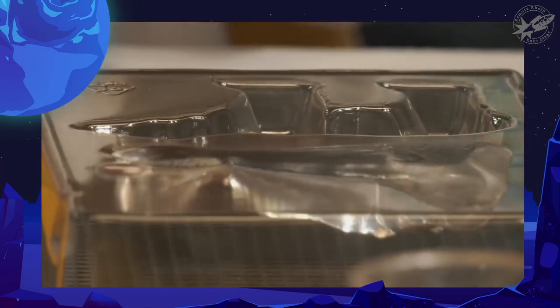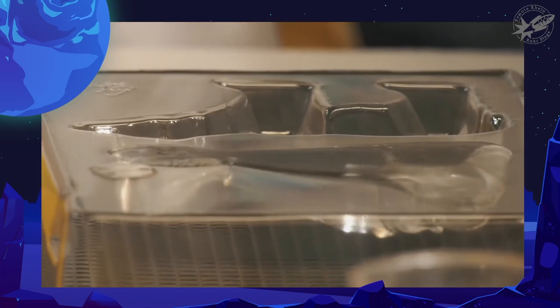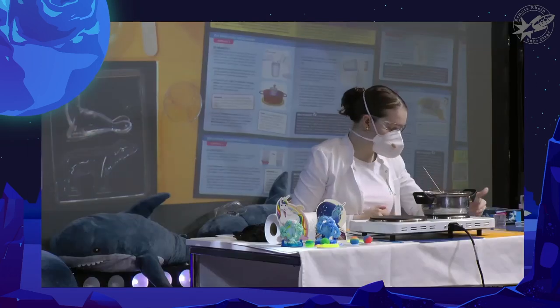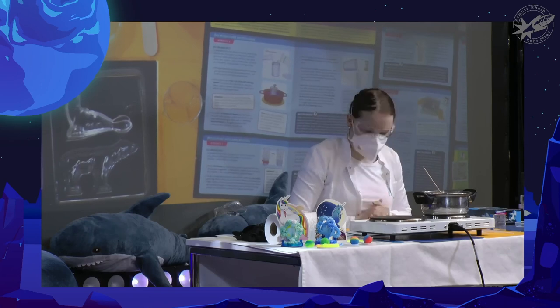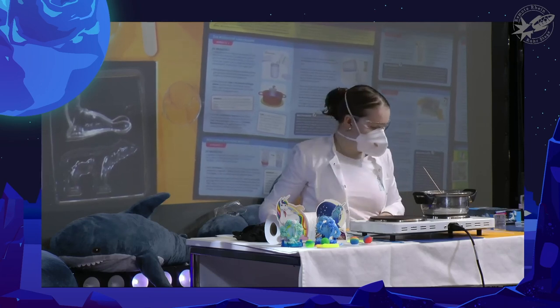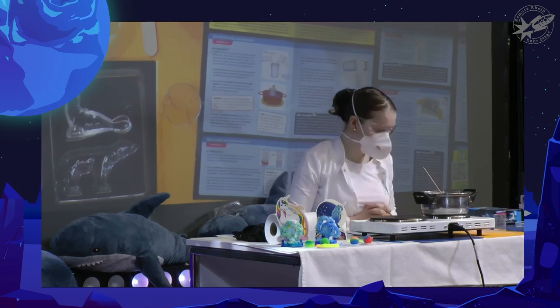Und wenn sich das jetzt ein bisschen abkühlt, müsste es gleich anfangen zu kristallisieren und wenn ich gleich an dieser Starterkristalle rein tue, wird das. And once this has cooled down a bit, ich habe jetzt mal die Experimente vorbereitet. It should crystallize. Gehen wir mal zu inhaltlichen. And when I put one of the starter crystals in here, it should crystallize completely.